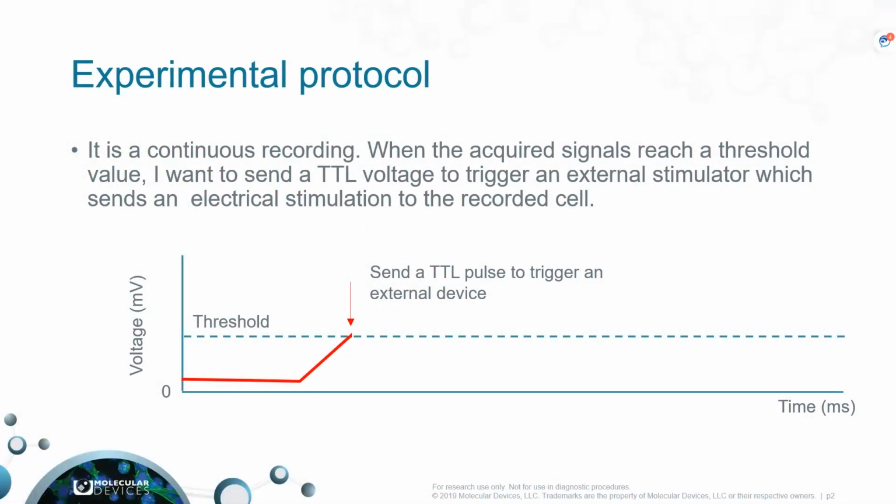In the past, I have been helping a lot of customers create protocols for their experiments. One of the frequently asked protocols is illustrated in this slide.